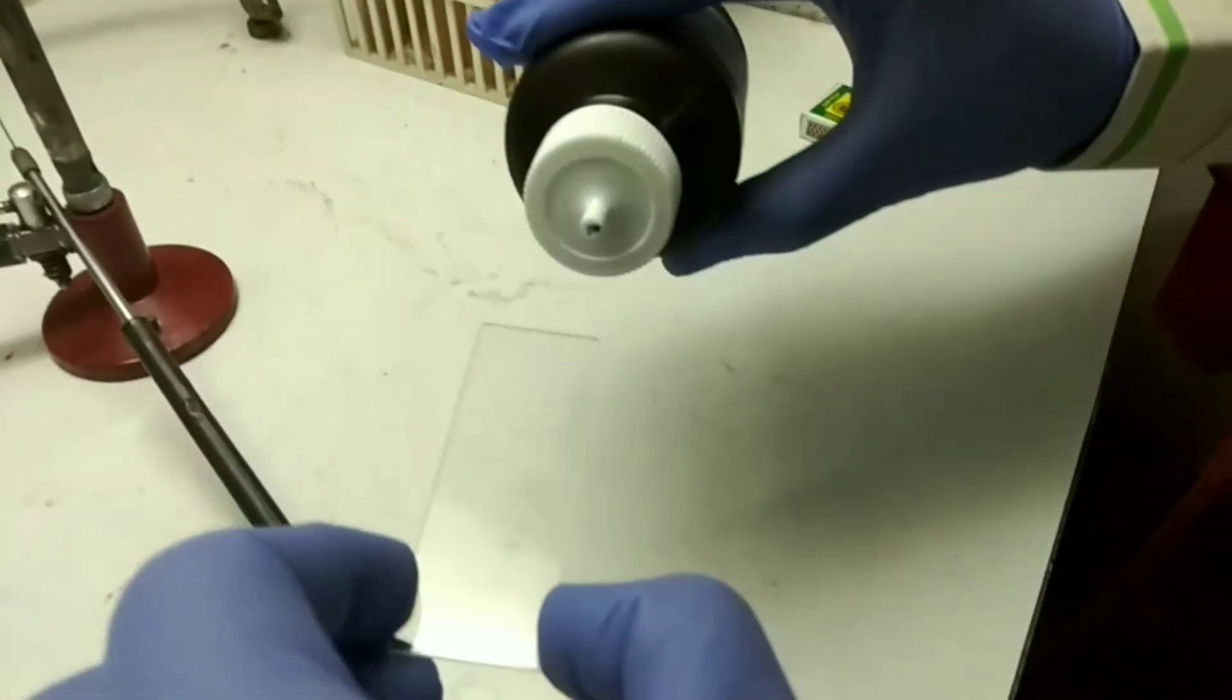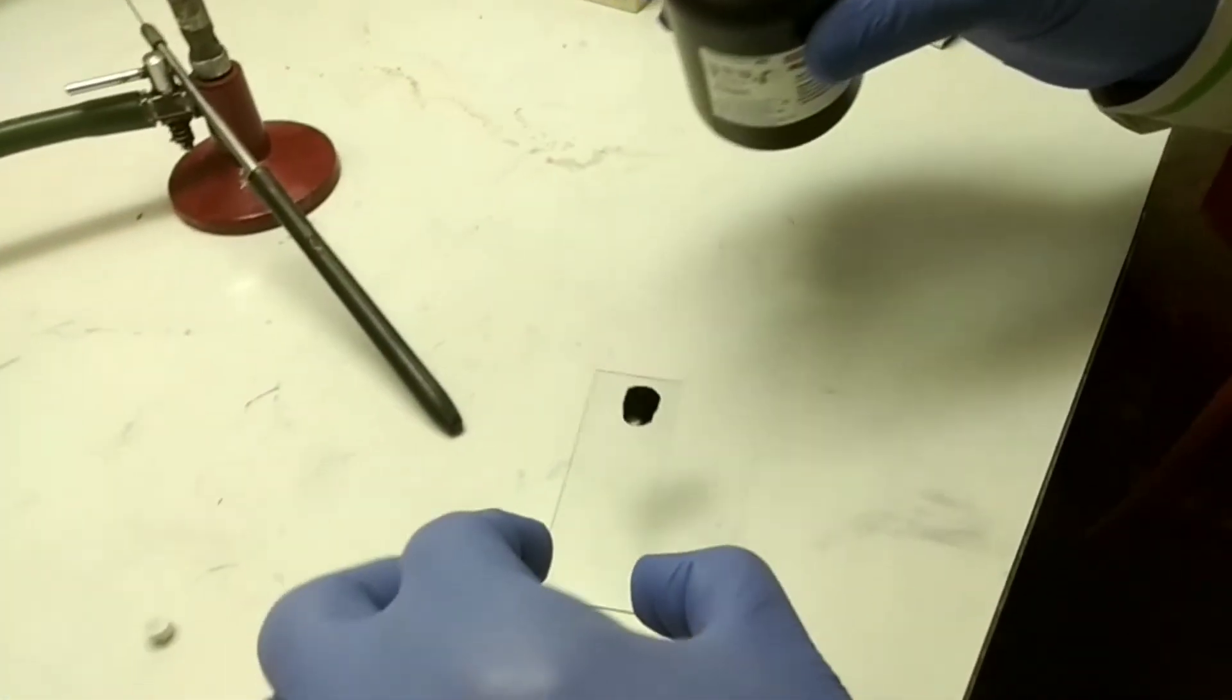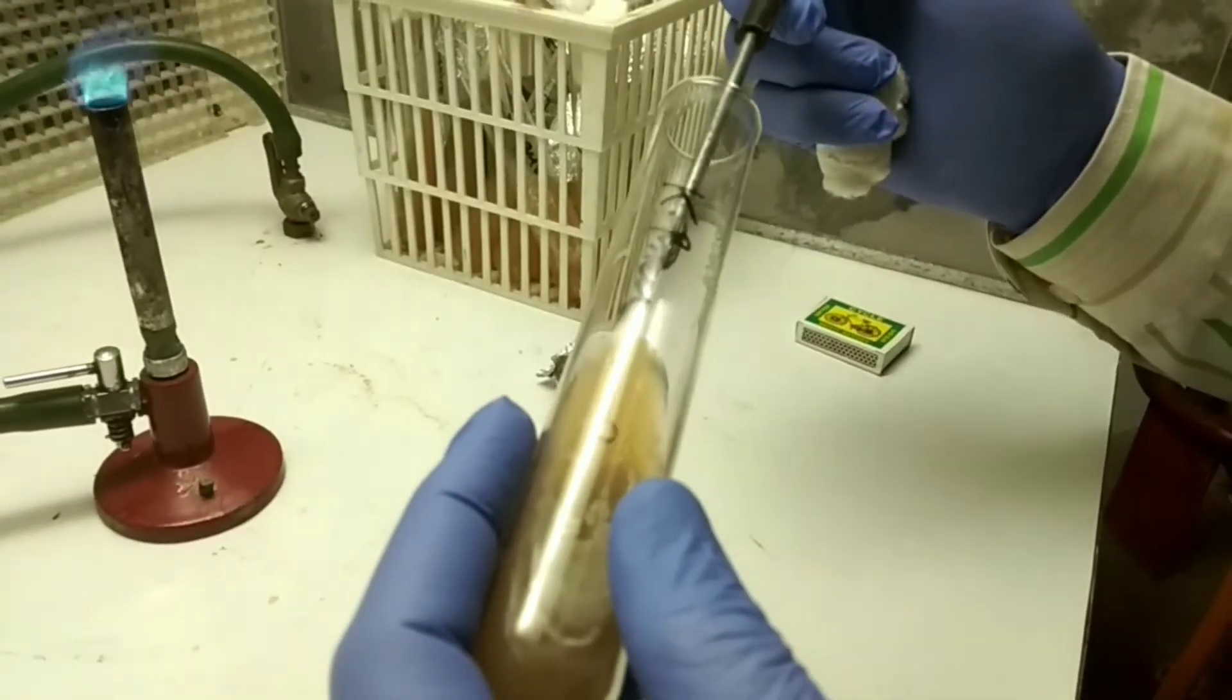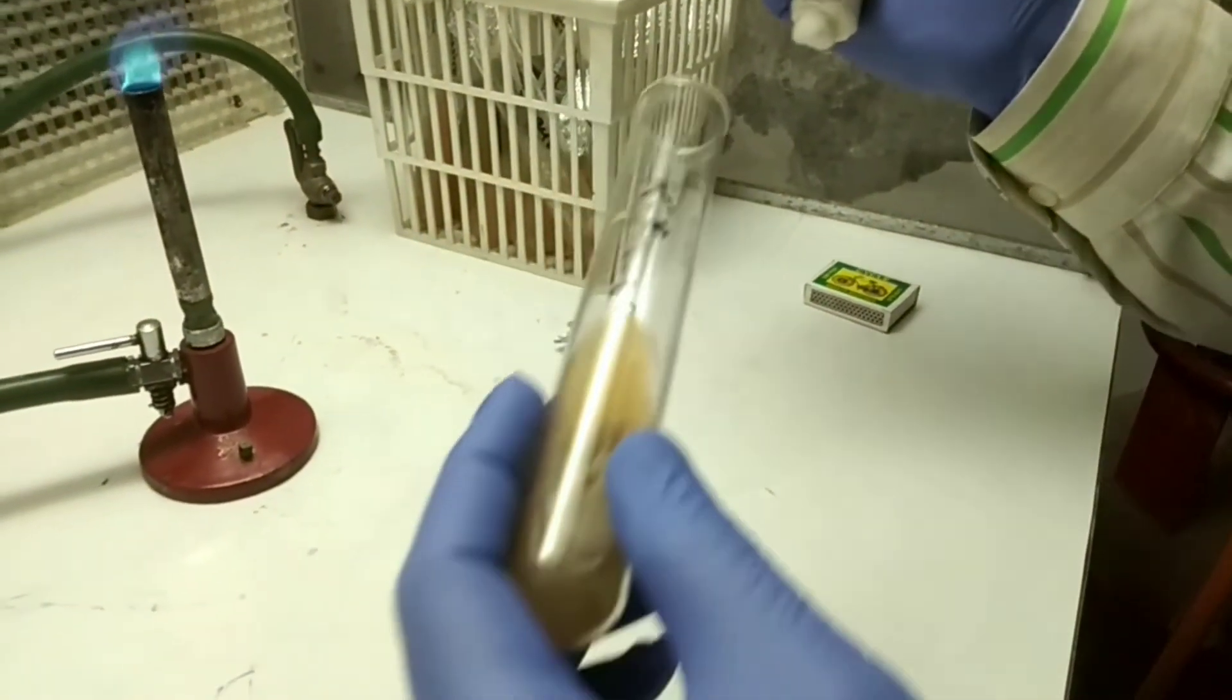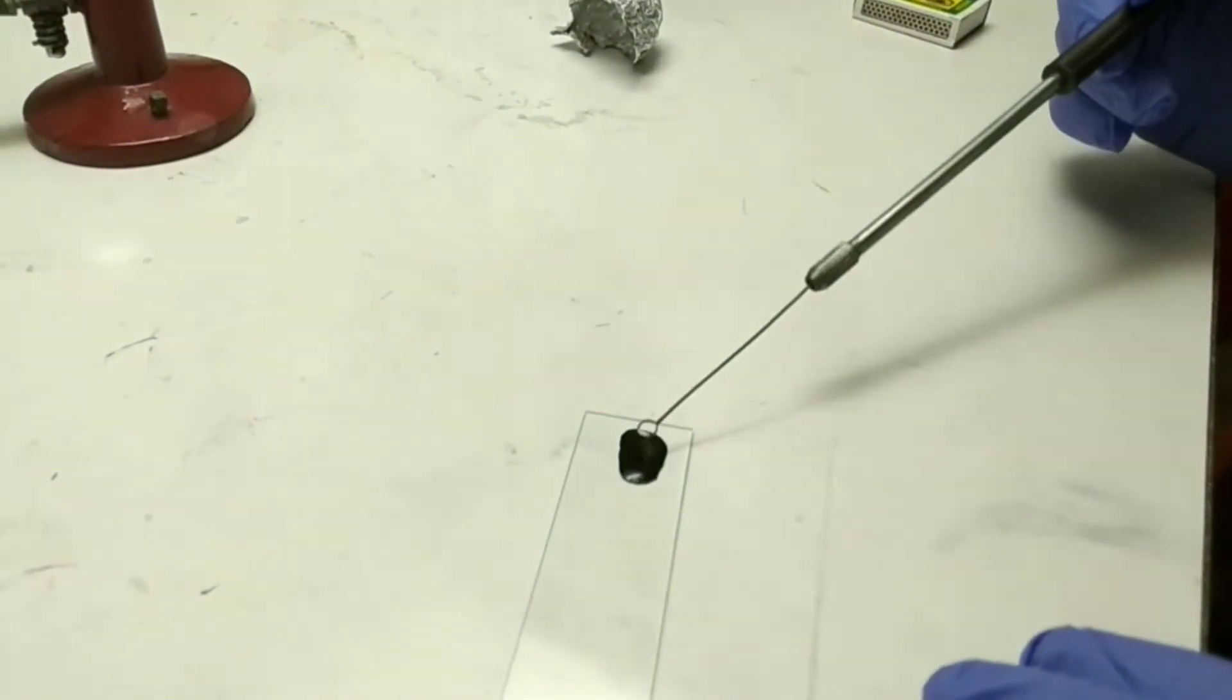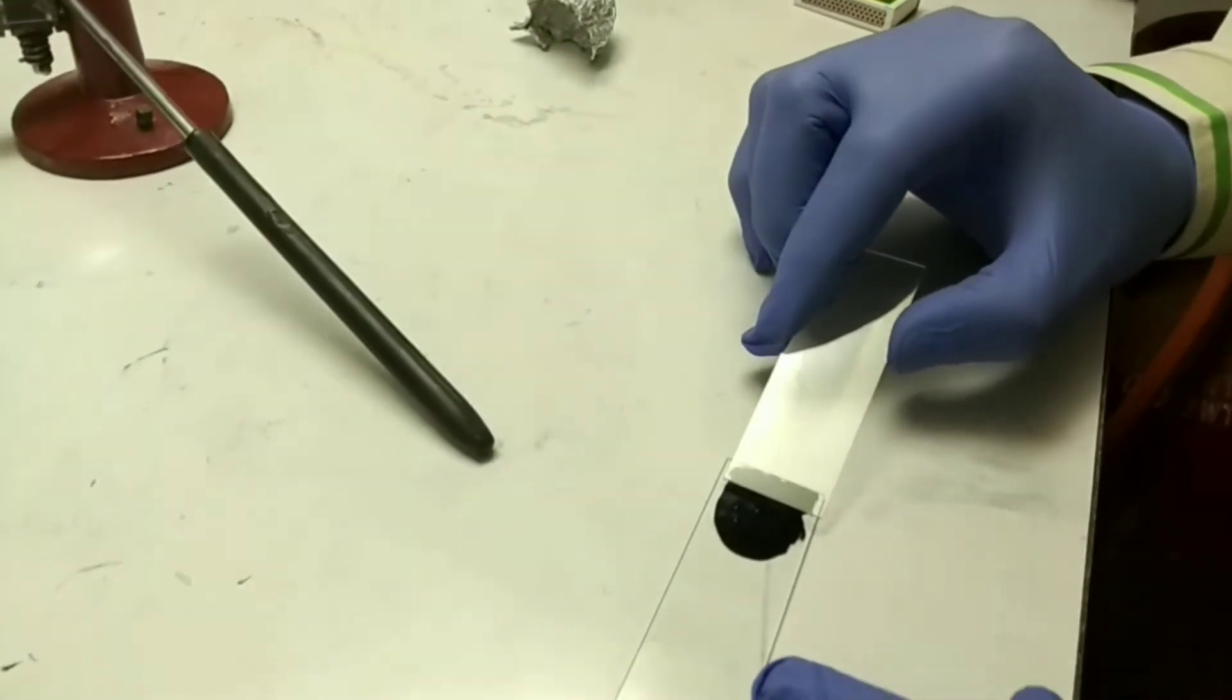Now the procedure: firstly we have to take a drop of nigrosin on one side of a slide, and then we have to sterilize our loop and take the culture of Klebsiella pneumoniae with the loop. After that we have to mix the culture of Klebsiella pneumoniae with the nigrosin droplet.